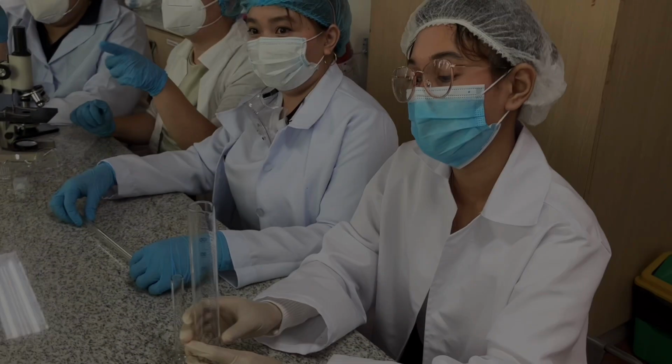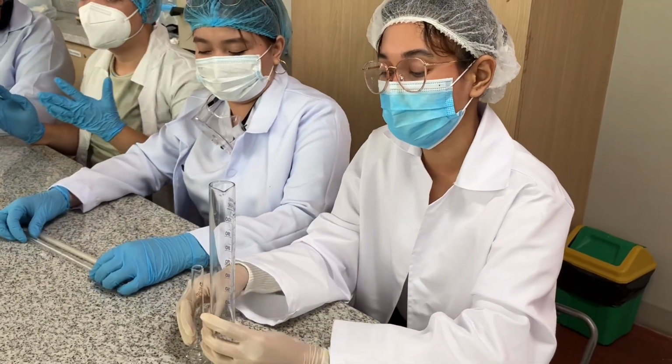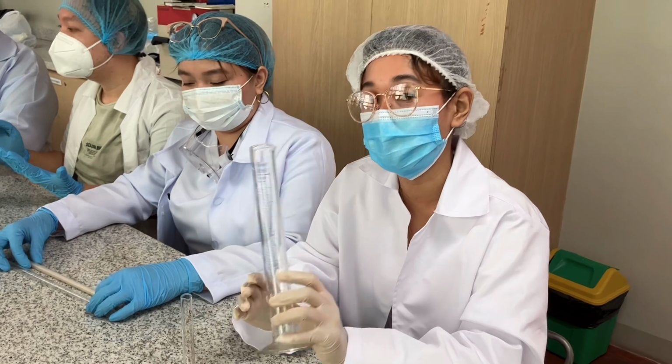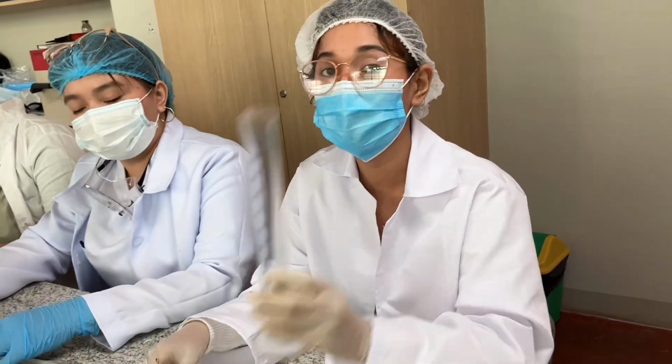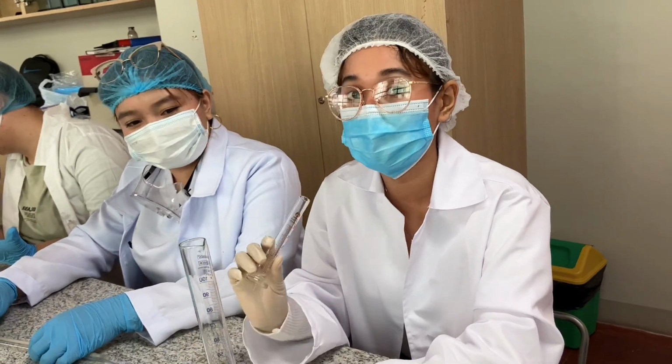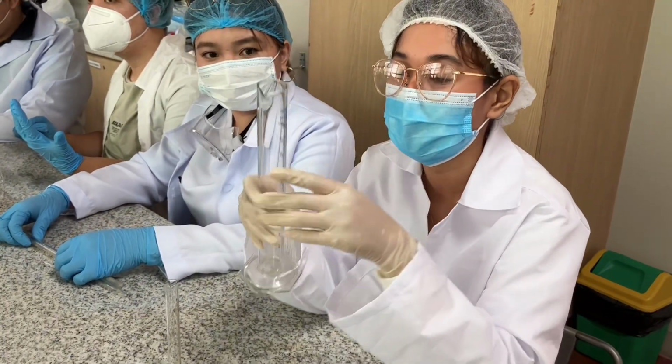Hi! Ano naman ang tawag dyan? Hi, this one is called graduated cylinders. So this is the tool that is used to measure the level of the liquid in ml. So it comes in sizes, one for 100 ml and the other one is for 10 ml. So in order for you to use it, you can read the measure at eye level.